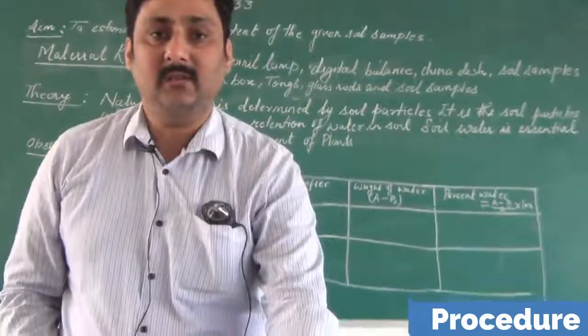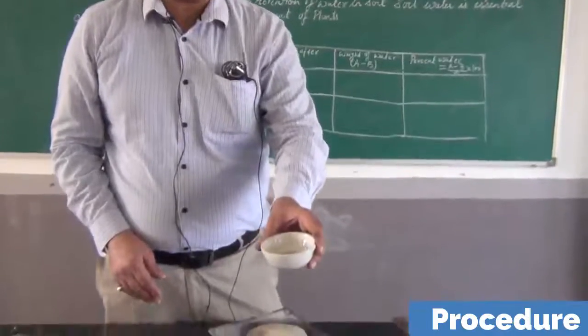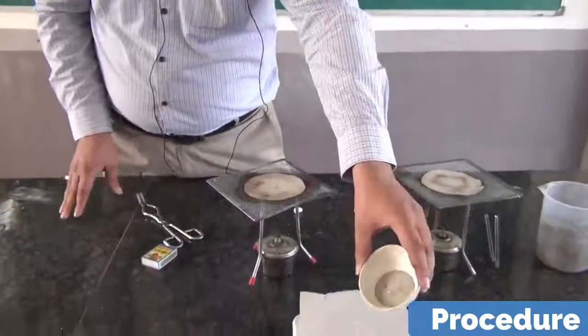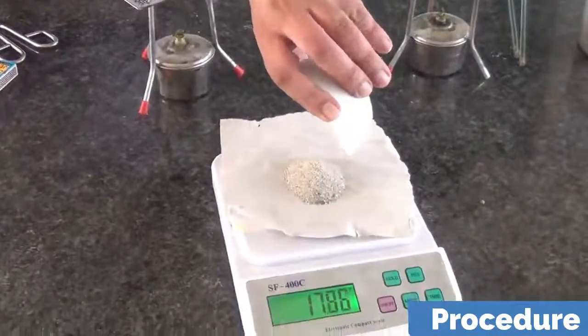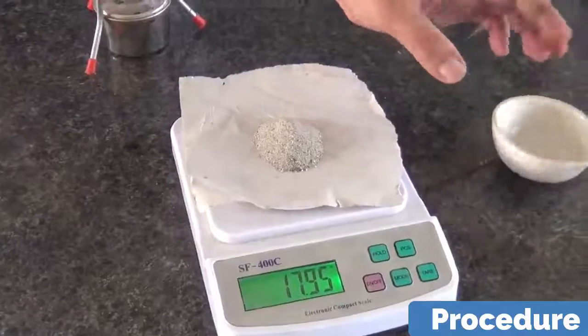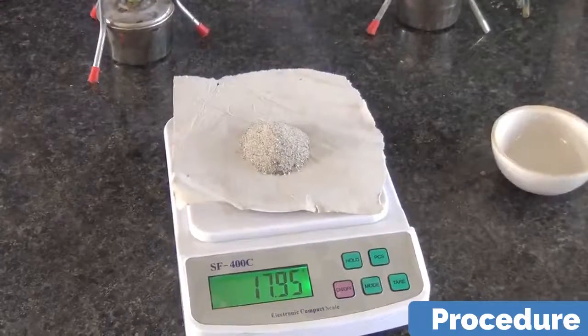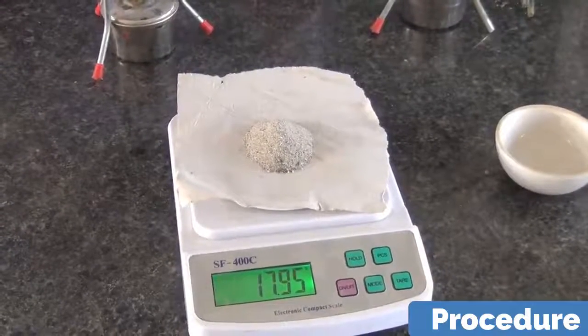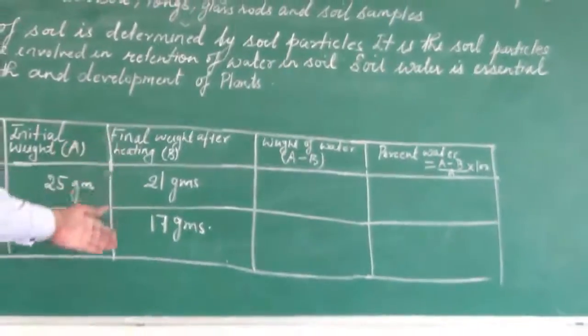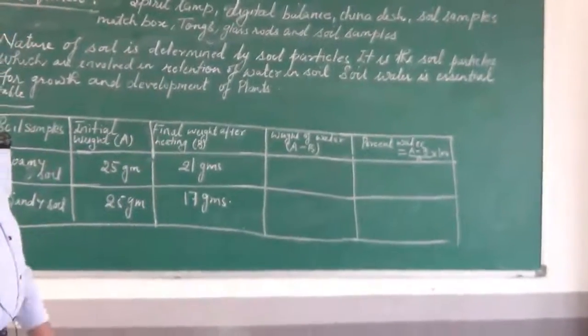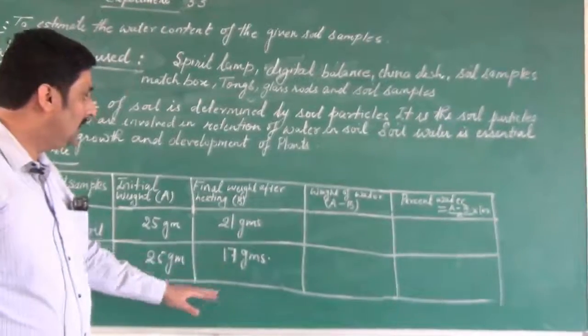Now see the sandy soil. We have to determine the B part, that is weight after heating for 10 minutes. So let us now weigh it on the digital balance. And you see the weight is something around 18, 17.95. So this is the final weight of the soil after heating as it is written on the board.